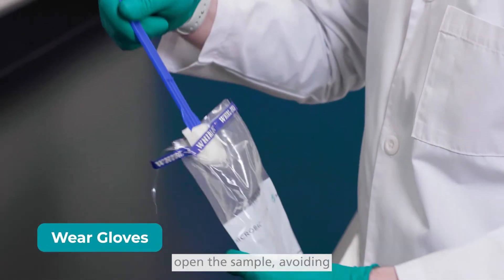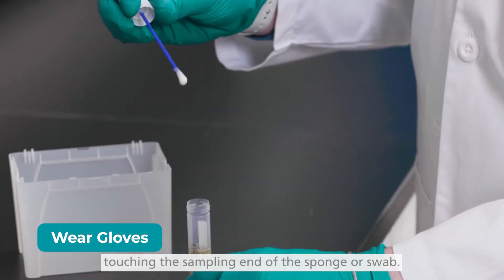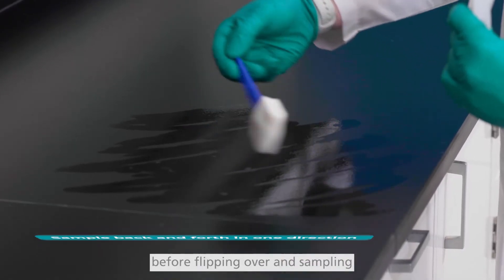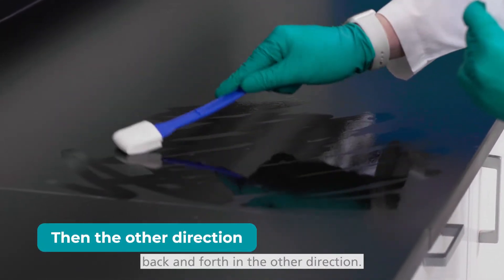While wearing gloves, steadily open the sample, avoiding touching the sampling end of the sponge or swab. Take the sponge or swab and sample back and forth in one direction before flipping over and sampling back and forth in the other direction.